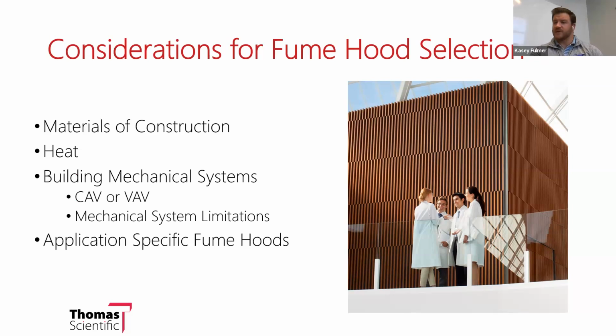And then application specific fume hoods. The reason I'm covering all of these is because applications in fume hoods are extremely vast. It's hard to pin down one specific application, but working through these considerations can help any user make sure that they're safe in the process that they're doing, and that's the goal of having a fume hood, making sure that the user is safe.